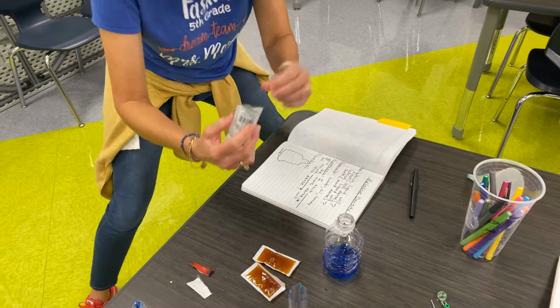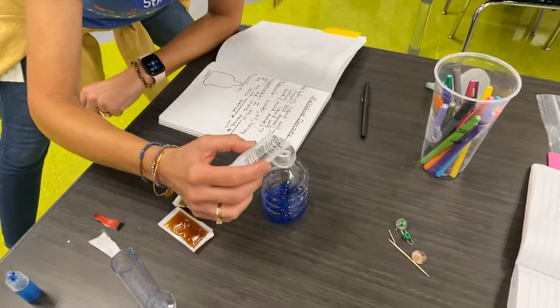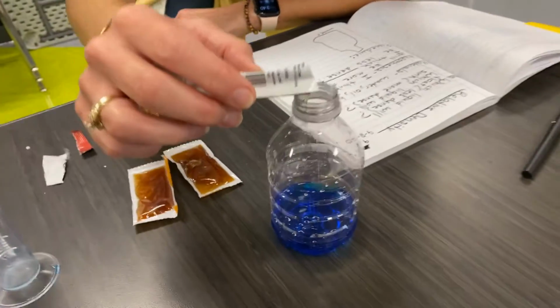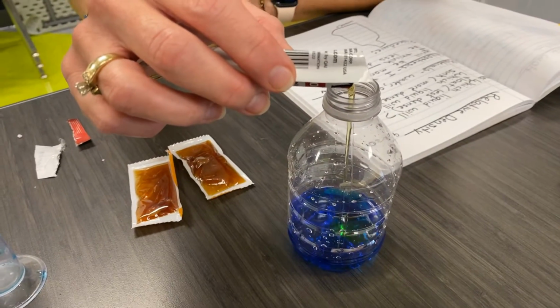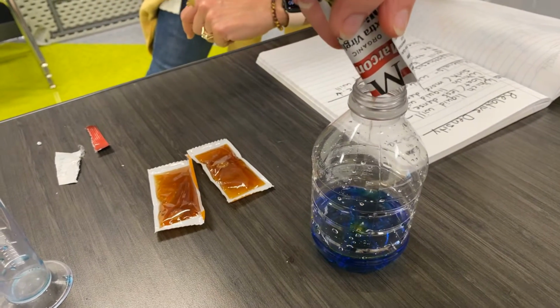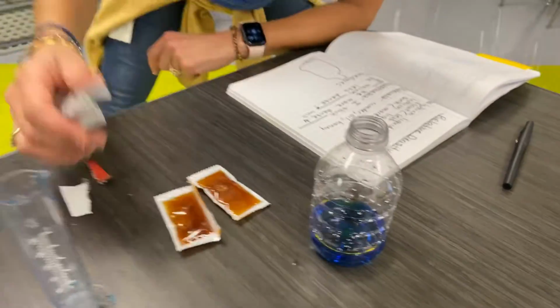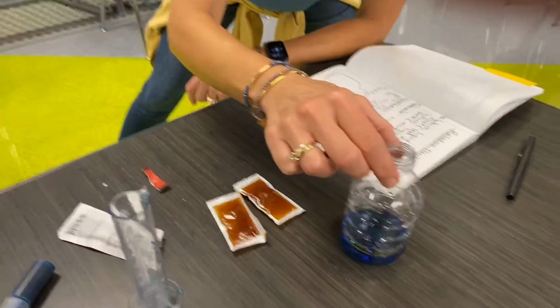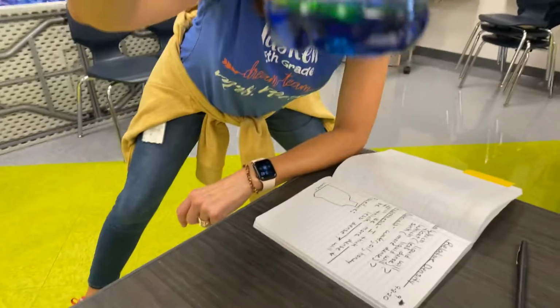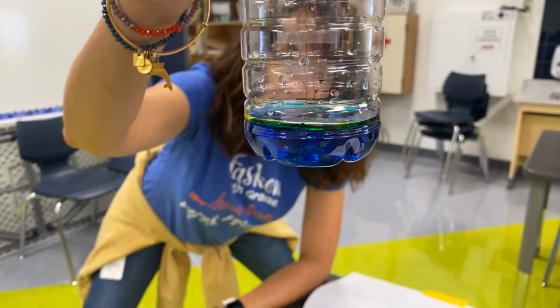All right, I'm going to carefully pour my oil. There is the oil in the water so far.